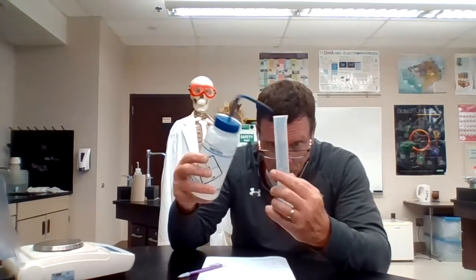All right, our first measurement then is with water at 10 milliliters. Just got to find my 10 milliliter mark. Check my meniscus. There we go, 10 milliliters. And we read 31.02 grams.